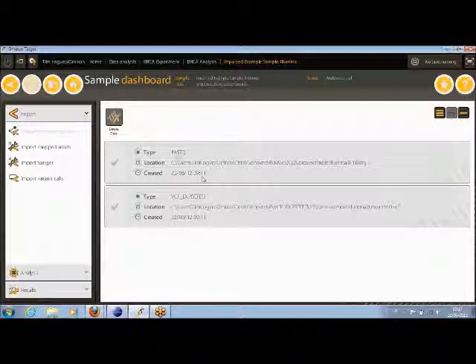We don't have to work just with raw sequencing data. We can also work with data that's been mapped by any other tool in SAM or BAM format. We can import some Sanger data in here, so you can see that alongside your short read data in the genome browser that I'm going to demonstrate a bit later.